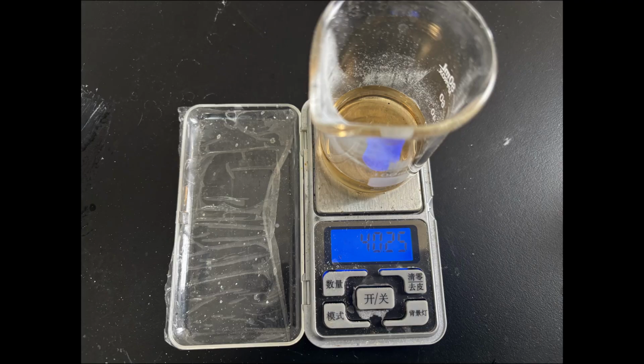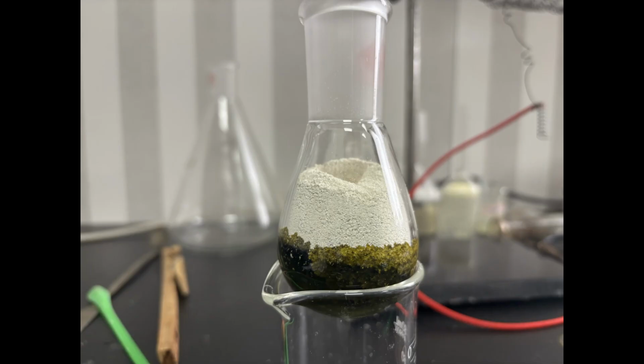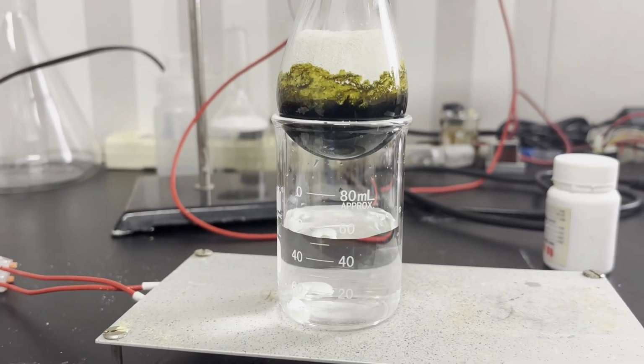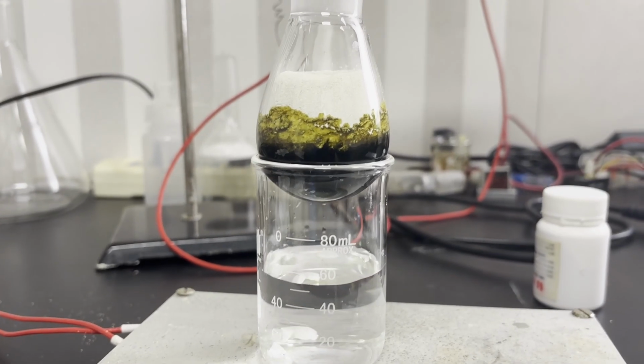I add it to a small flask, and then weigh out 40 grams of 95% sulfuric acid in a beaker. My acid is slightly orange due to impurities, but the reaction will still work. The moment the sulfuric acid is added to the flask, a beautiful olive green color appears, which is the color of protonated acridone.